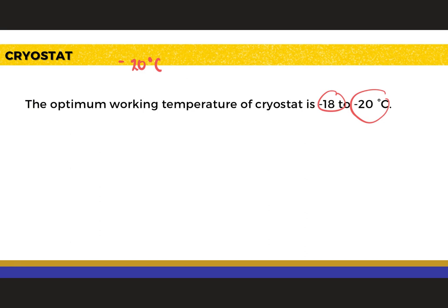The tissue for freezing should be fresh and freezing should be done as quickly as possible. Slow freezing can cause distortion of tissue due to ice crystal artifacts. The success of fresh tissue sectioning depends to a large extent on the temperature, both of the tissue and of the knife. Certain tissues such as fat or mucin and hard or dense structures in a soft matrix require much lower temperatures to impart a suitable consistency for cutting.